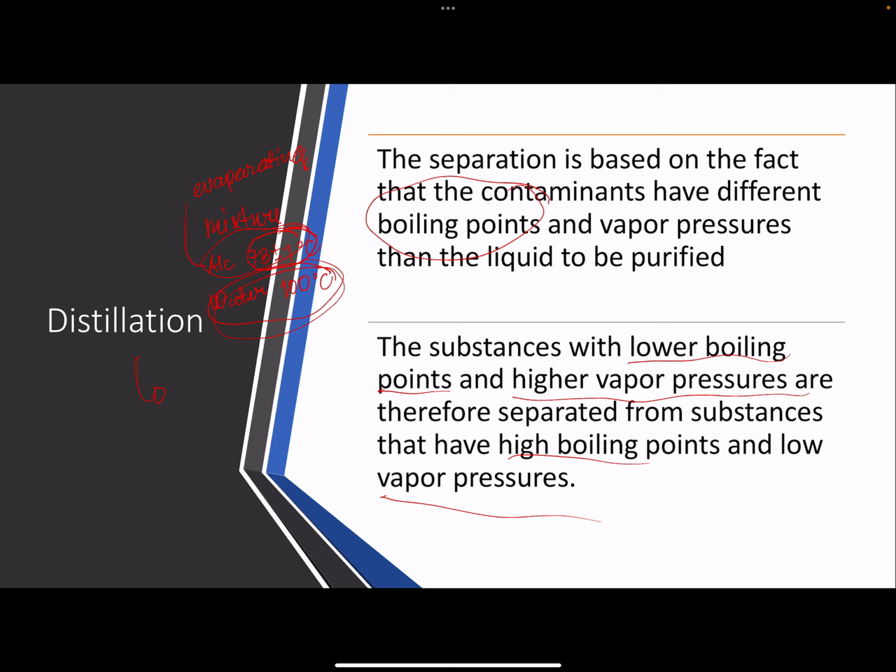And you probably hear about it often. Distillation is very useful when we are making alcoholic spirits. This is a method of purification for alcoholic spirits. But it has lots of laboratory applications. Maybe you think that's its only application. So anyway, distillation again, its purpose is to purify and separate mixed liquids. But in this case, its principle is boiling points.